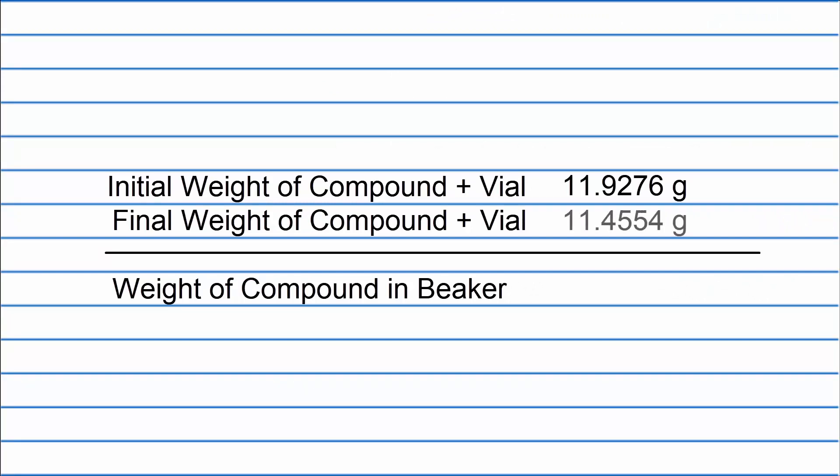The mass of compound transferred to the beaker is the difference between the first and second readings of the container. You now know how to weigh by difference.